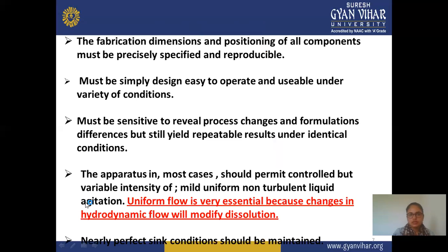Now we start. The fabrication, dimension and positioning of all components must be precisely specified and reproducible. This means the dimensions and components of the dissolution apparatus are properly and precisely specified and reproducible, and you can use it without any problem or without setting any dimensions. You can set the temperature and speed parameters on the monitor and start performing your dissolution test.